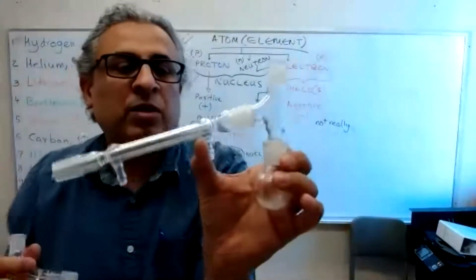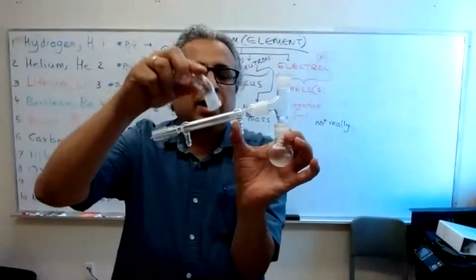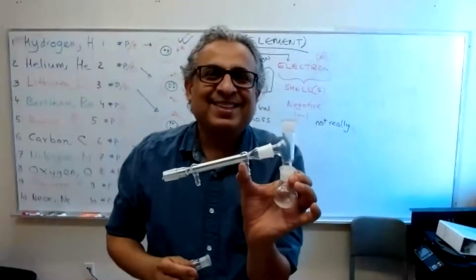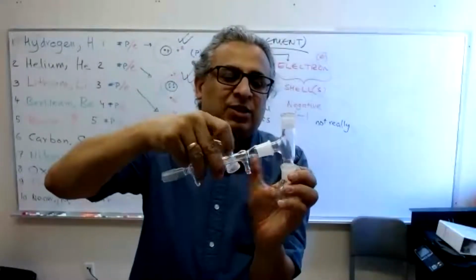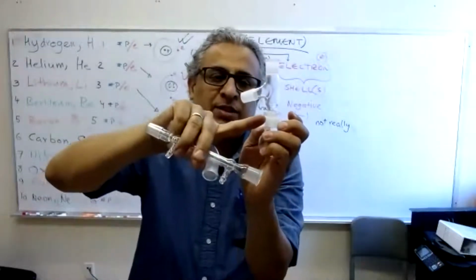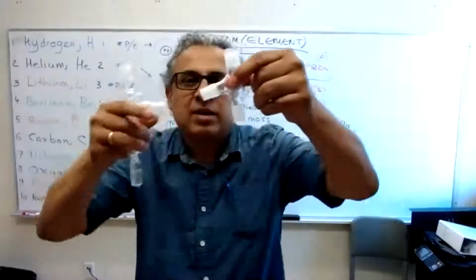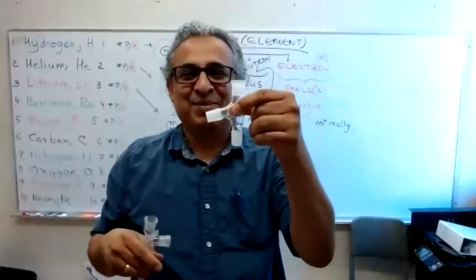And so we haven't settled something. Round bottom flask, condenser. What is this guy called? Who remembers? This is a ground glass joint, that's a ground glass joint, that's a ground glass joint. There are 2 ground glass joints here. One is female, one is male. What is this guy called? Is it a 3-way adapter? That's very intelligent, but it's not called a 3-way adapter.